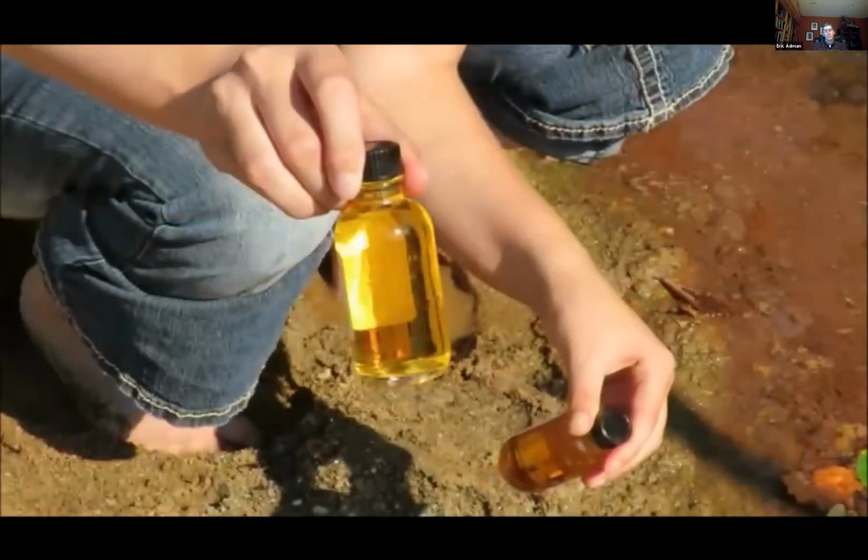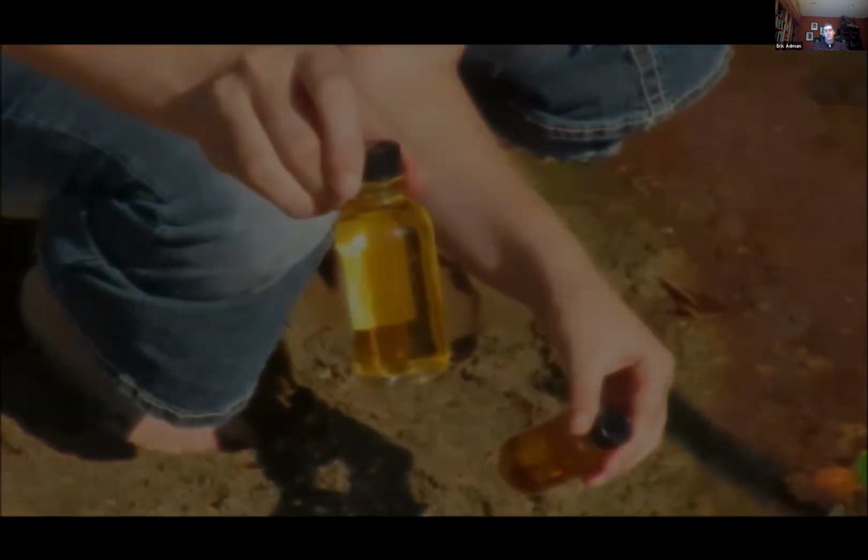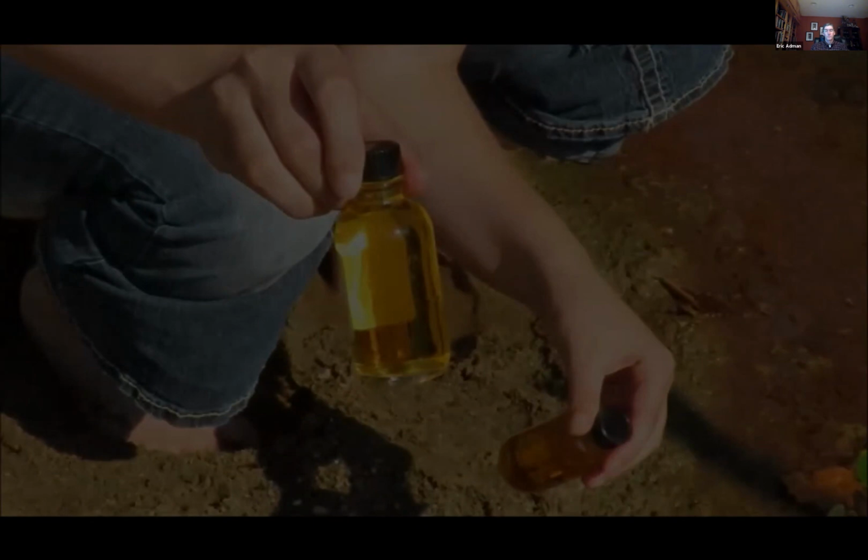Your final sample should resemble apple juice or tea. At this point, your samples are now fixed. This means the oxygen in the sample is chemically trapped and that contact between the water sample and the atmosphere will not affect the test result. Please watch the second dissolved oxygen instructional video to see the proper method for titrating your samples.